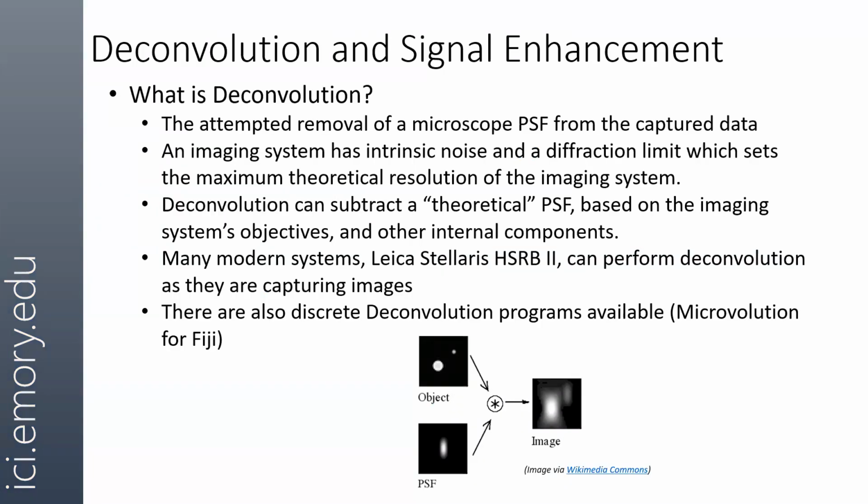So, touching upon deconvolution, what is deconvolution? Hand in hand with that concept is what is a point spread function. There is some ground truth object, some ground truth sample on your slide or in your well or fixed and cleared and on the lattice or on a light sheet microscope. We are interrogating the structure of that object with photons of a certain wavelength to excite a certain fluorophore or whatever. That object we will never see as clearly as it exists because each of our systems has a point spread function. That is an intrinsic distortion to the light that passes through the microscope, to the camera, to your eye, through the monitor.